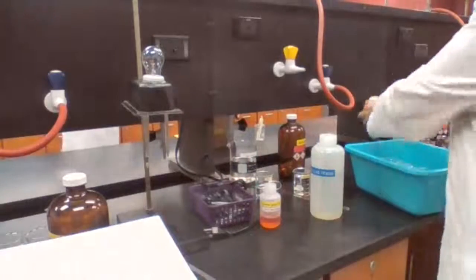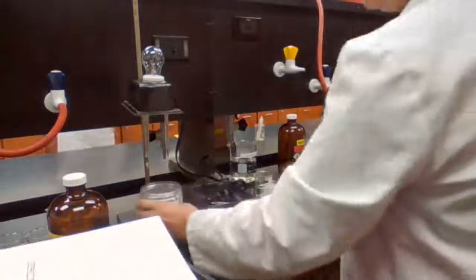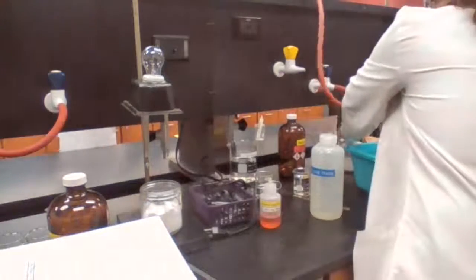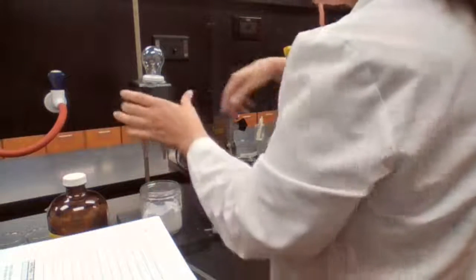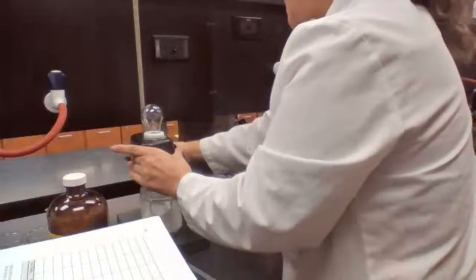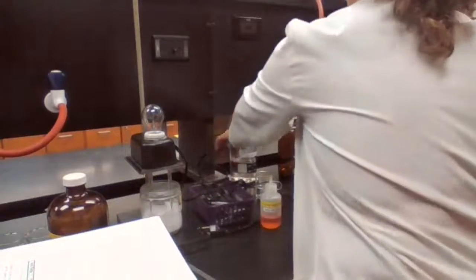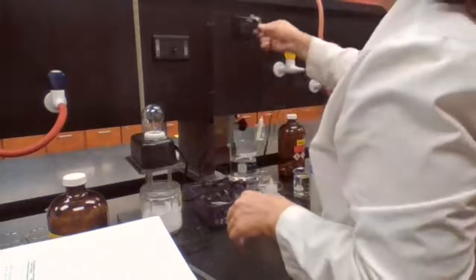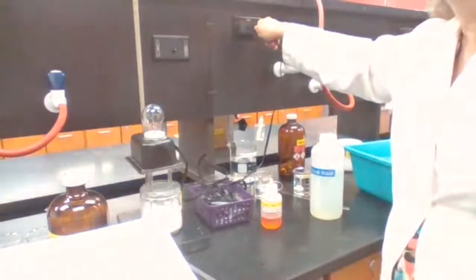Next, it would be sodium chloride, but solid sodium chloride. Let's see what we have for solid sodium chloride. When we connect it, no light.